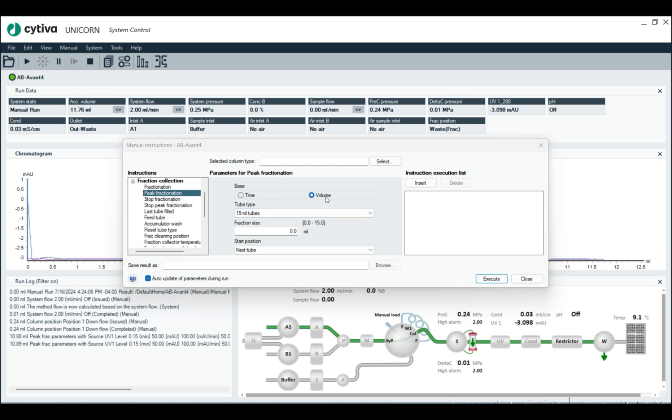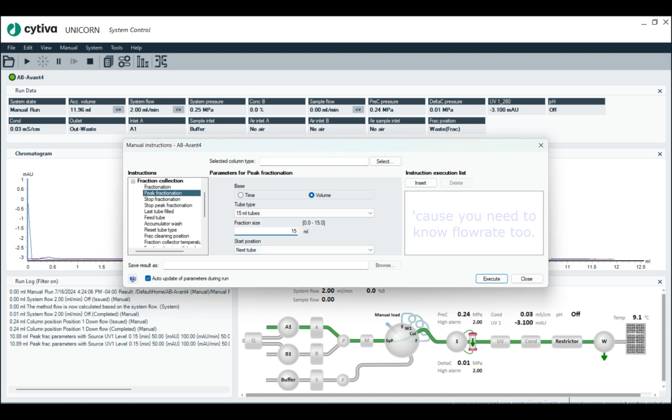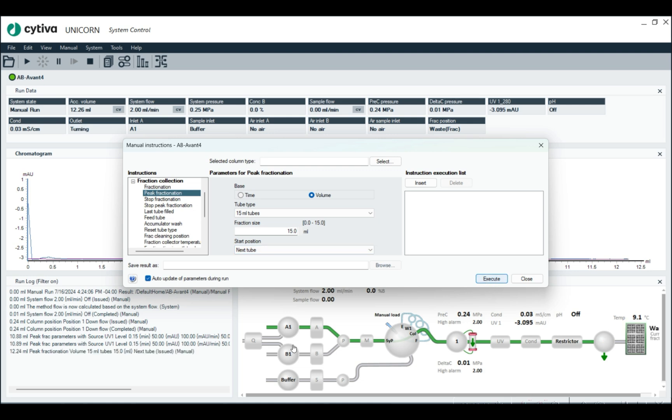We can do time or volume. Time, you sort of have to do some math in order to collect it. We're just going to do 15 mil tube size. And the first tube we're going to collect is going to be the next tube that's available and hit execute.